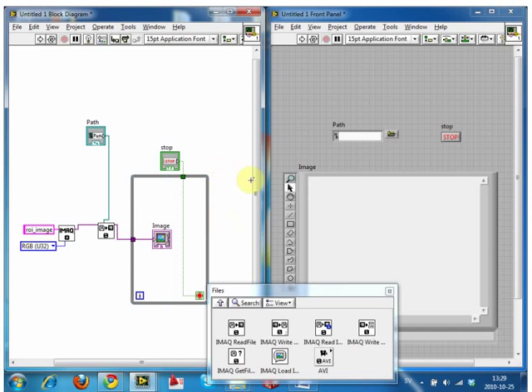No, we're nowhere near that point. You're jumping too far ahead. All we're doing right now is we need to draw a box on the image, okay? But to allow us to draw the box on the image, we need the program to keep running. Ah, that's what you mean, you stop the program.